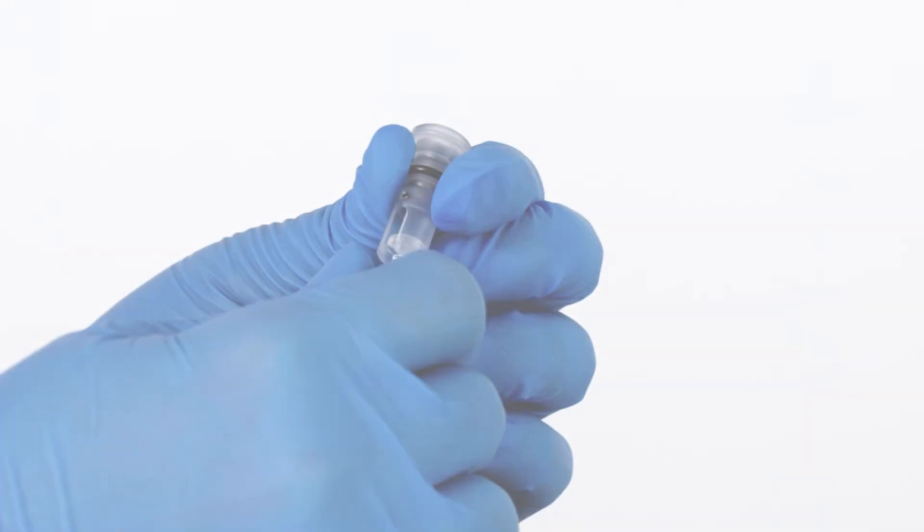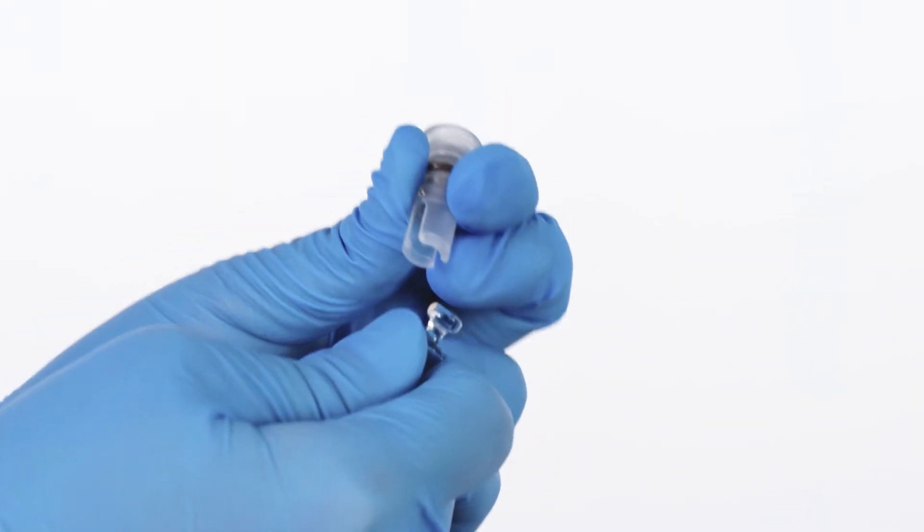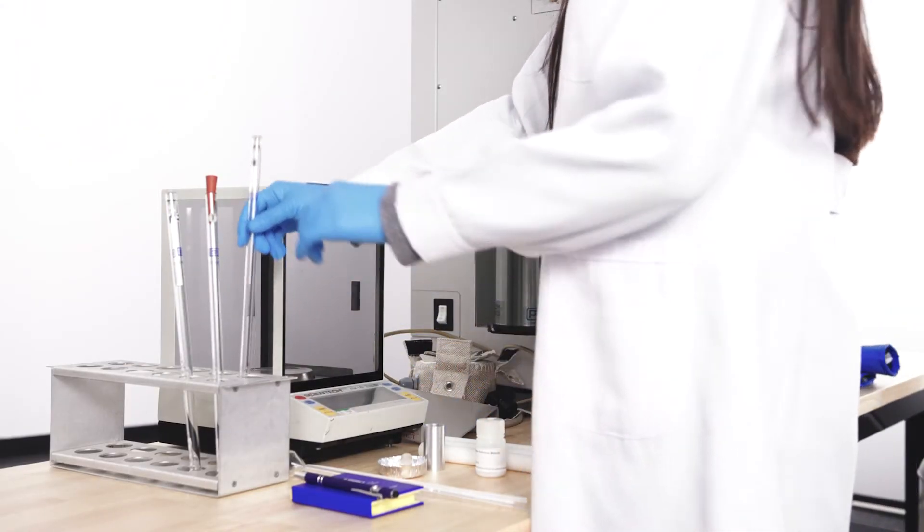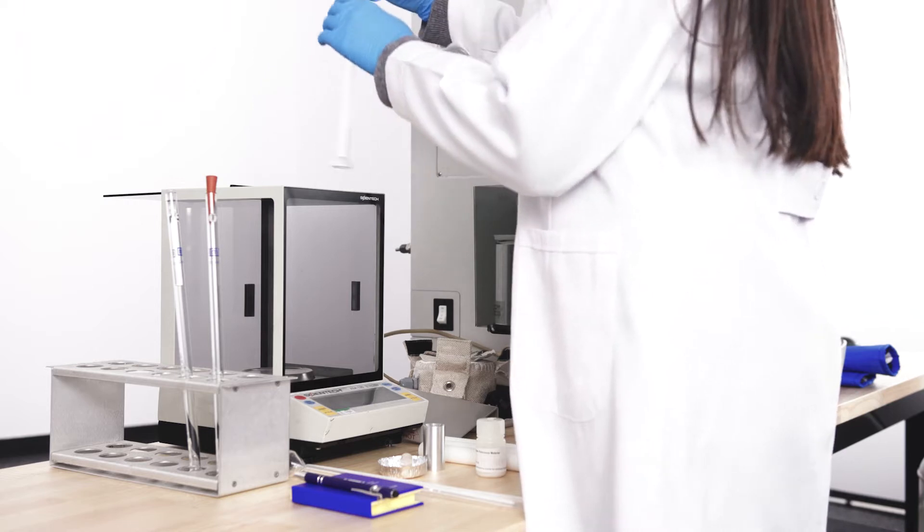Weigh the empty sample tube with either a check seal without the filler rod attached or a rubber stopper. Use your good lab practices to determine the mass and record.